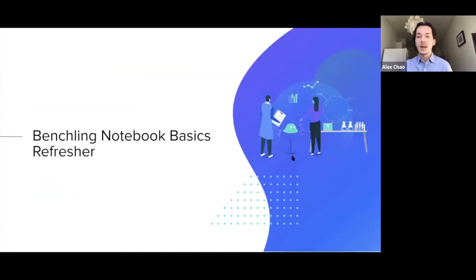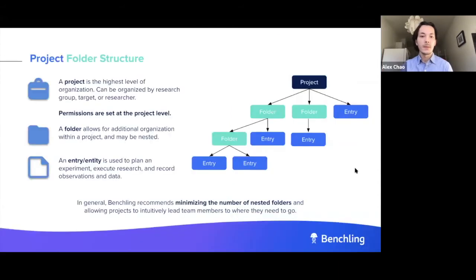We'll now go through a refresher on some of the concepts that we covered in the Benchling Notebook Basics Bootcamp that happened a couple of weeks ago. Again, to give everyone a reminder of project folder structure, within the Benchling Notebook, we do have a hierarchical organization of the data that lives within it.